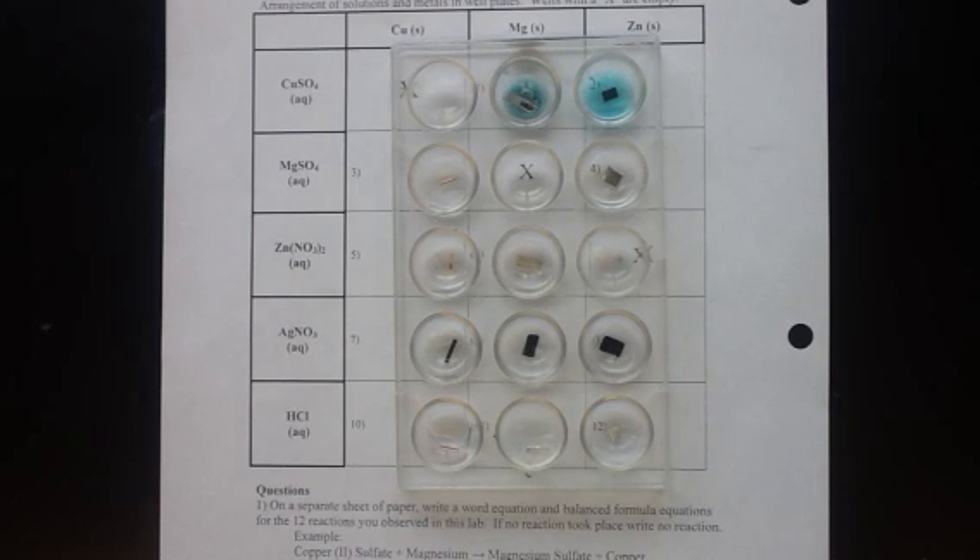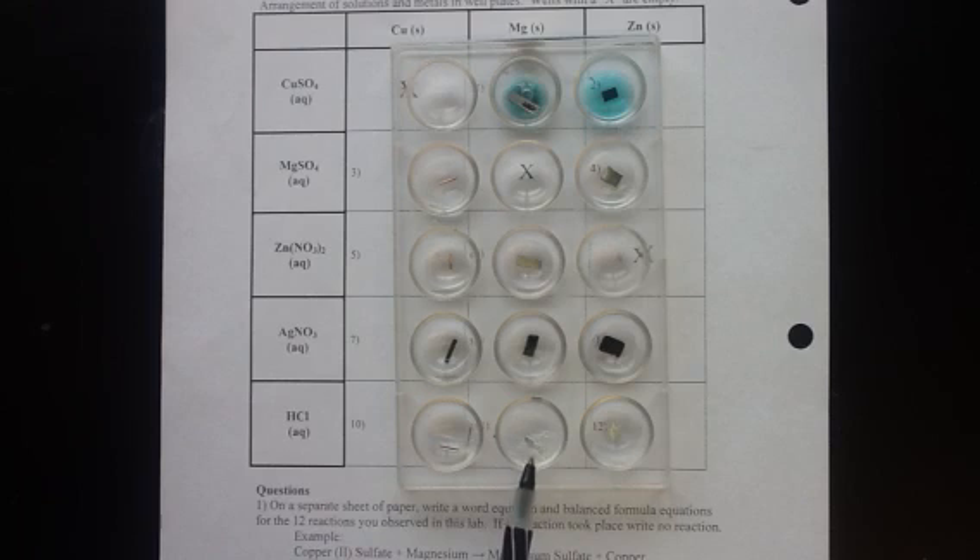Now we can take a look and see what reactions took place. The most obvious reaction is right here with the hydrochloric acid and the magnesium - we have rapid bubbling, that's hydrogen gas being produced. Over here with the zinc we have a similar reaction taking place, with some bubbles starting to form - those are also hydrogen gas. When the copper is mixed with the hydrochloric acid we actually see no reaction, which tells us that copper is lower on the activity series and less reactive than hydrogen.